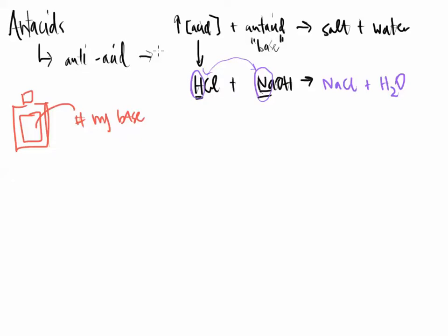So when I begin to titrate this sample, and I begin to do my calculations at the very end of this analysis, hopefully my number will be the number that is on that label. That way, Tums is not lying to us. Rolaids is not lying to us. And we call this process a label validation process. Okay? So label validation basically means just that. I am validating this label that's on this product that you have purchased.